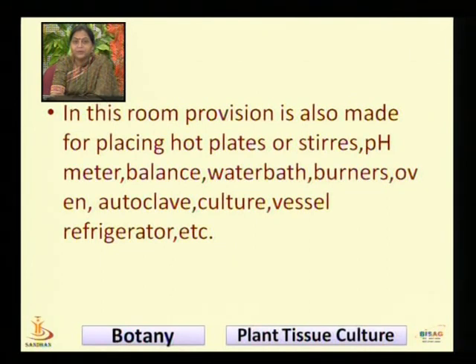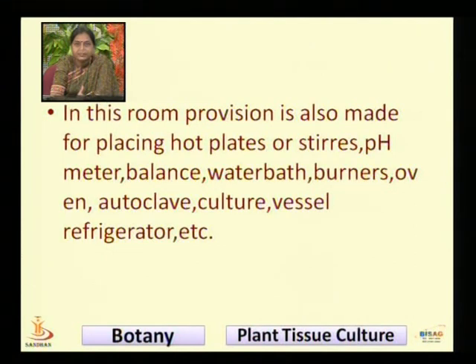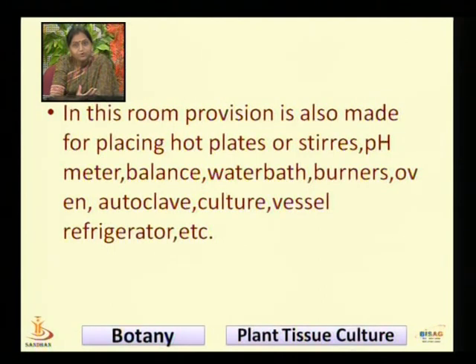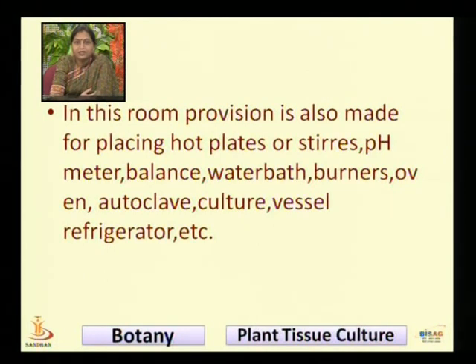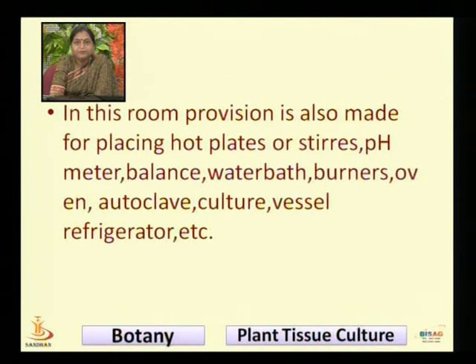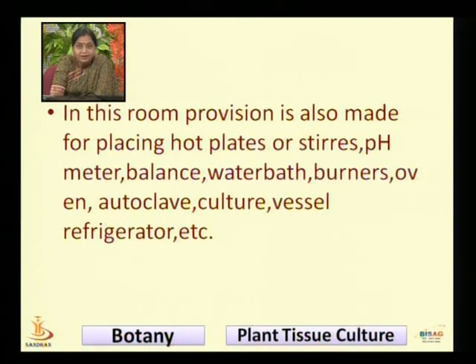In our laboratory we have one room where we keep all these instruments. We prepare Petri dishes — or Petri dishes — for culturing different microorganisms, different tissues, embryos, and haploid plants. We can also culture immature embryos and then develop them into new plants. The provision for placing hot plates, pH meters, balance, water bath, oven, autoclave, culture vessels, and refrigerator should be present.